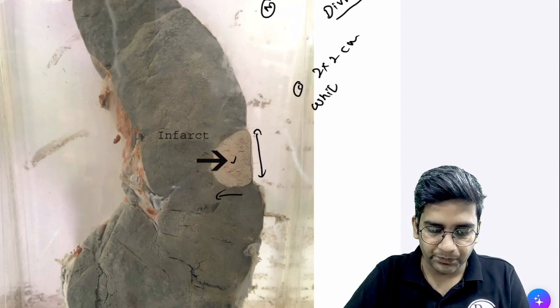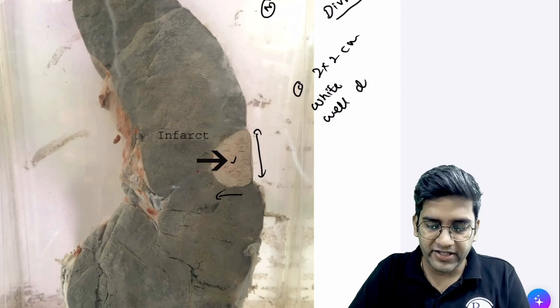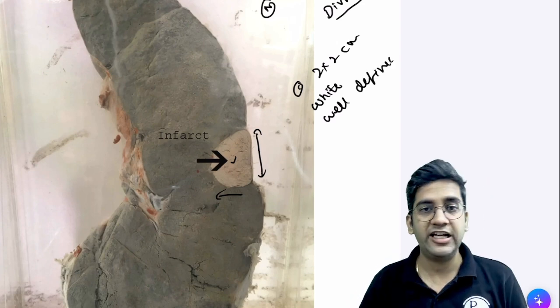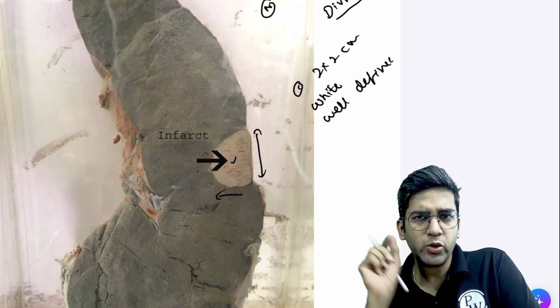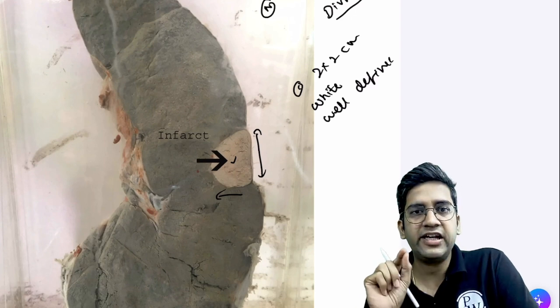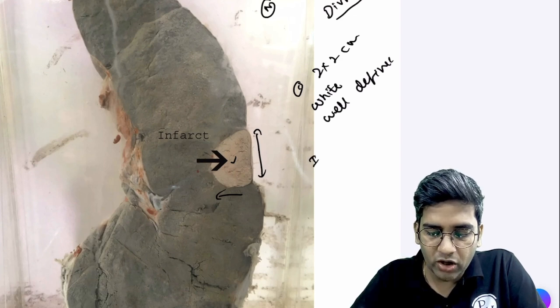Approximately 2 into 2 centimeter lesion which is a completely white in color and it's kind of well demarcated—a very well-defined lesion. It's definitely not an ill-defined lesion. To describe this lesion, I would say that looking at this well-delineated structure, looking completely white in color, looking like non-vascular tissue, I would think of an infarct of a spleen.